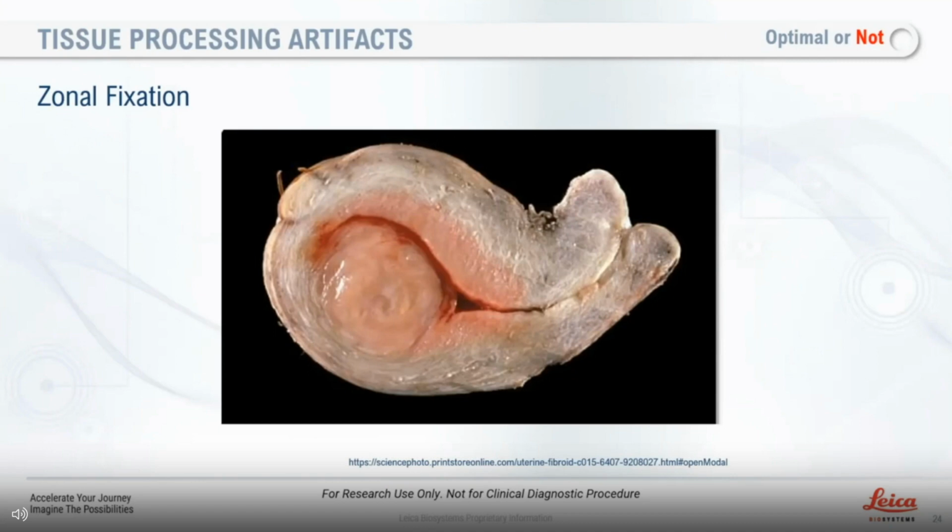This is a side view through a uterus. You can see that about the outer half has formalin fixation, but the endometrial canal, where there also looks like a submucosal fibroid, has a little bit too much red-pink appearance to it, which indicates to me that not only has fixation not reached this area, but it also looks like it might have some beginnings of autolysis.